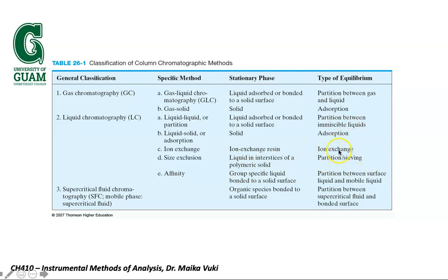Ion exchange is also part of the process, where there is exchange of ions based on their charges as they go through the column. And the last one is size exclusion chromatography.